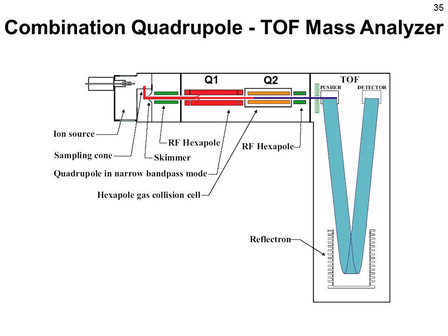In this instrument, the so-called QTOF, quadrupole time of flight instrument, ions are first focused and pass through Q1, the first quadrupole, that can be used again as an ion filter. They pass through Q2, which is again the collision cell where fragments can be generated. Then ions are focused again and reach the time of flight mass analyzer. Here we have a so-called pusher region.